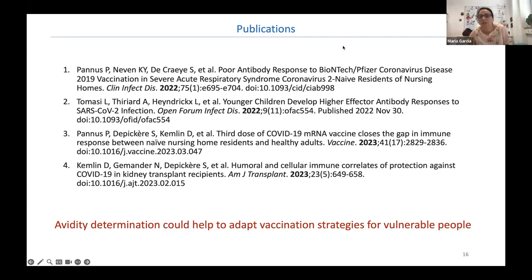So here, Don Jui Wu is asking, why are you monitoring K-off and not K-on? Because the K-on is dependent on the concentration of the analytes, whereas the K-off is not. The K-off is only dependent on the complex itself. And because it is independent of the concentration of ligand and the concentration of analytes, we can use this parameter alone to deduce the avidity.